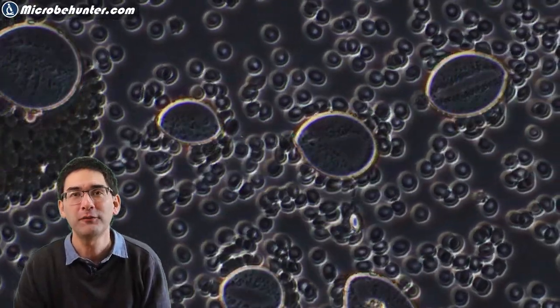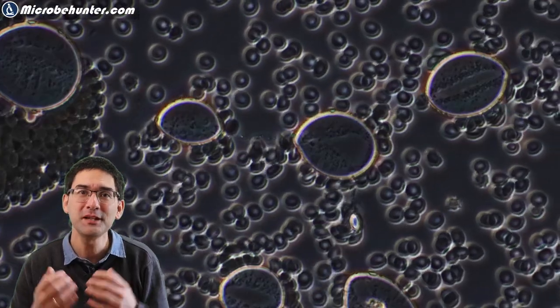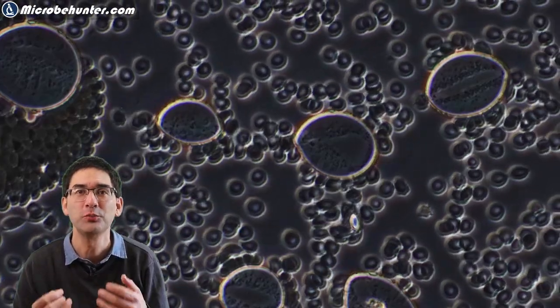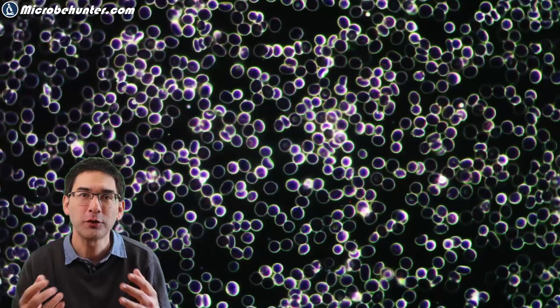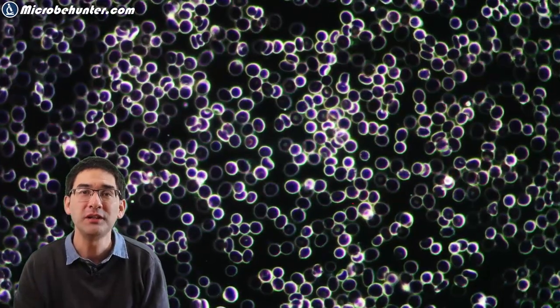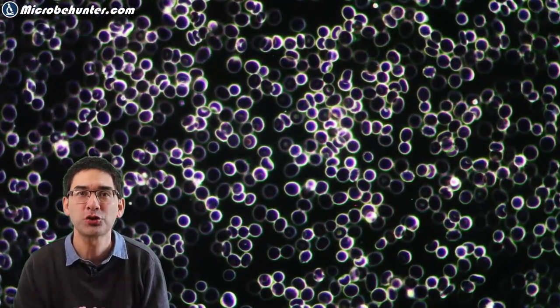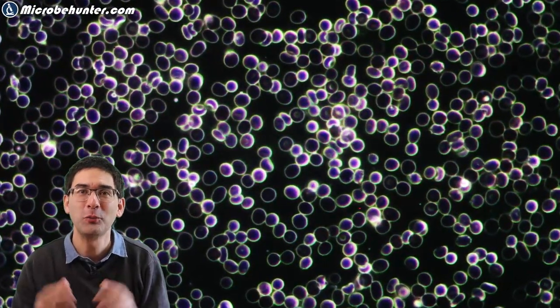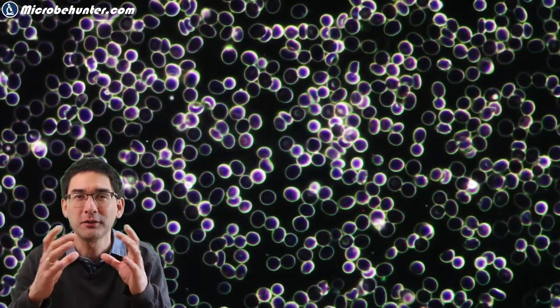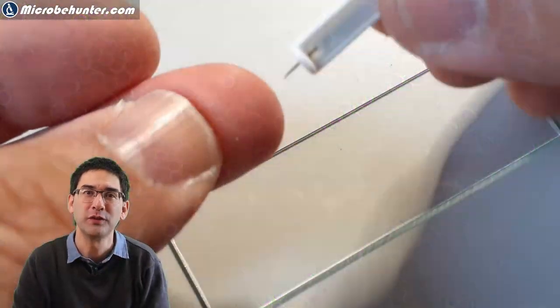Many of you probably do not have phase contrast at home, but it is quite easy to also observe them in dark field. All you need is to add a small dark field patch stop, a dark field filter to your microscope. And then the red blood cells start to appear bright in the form of bright rings.